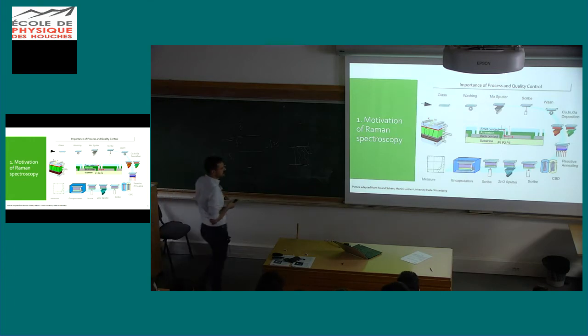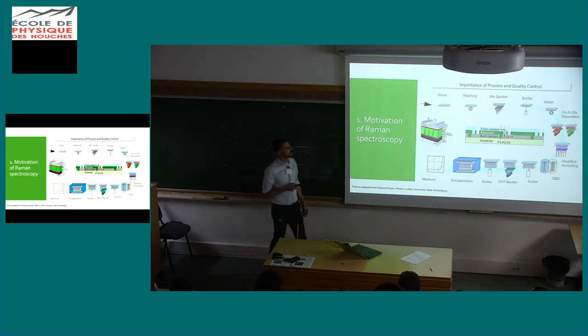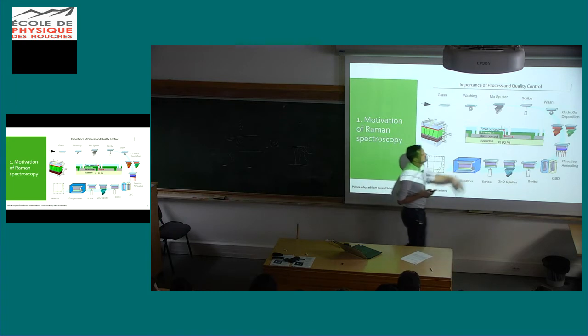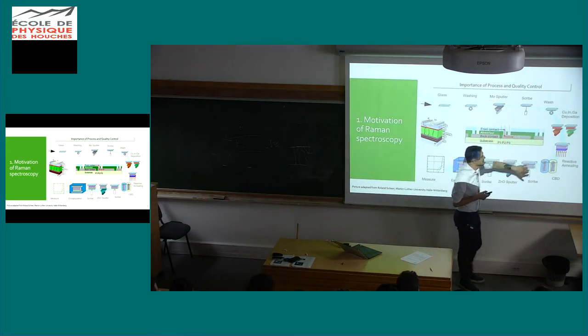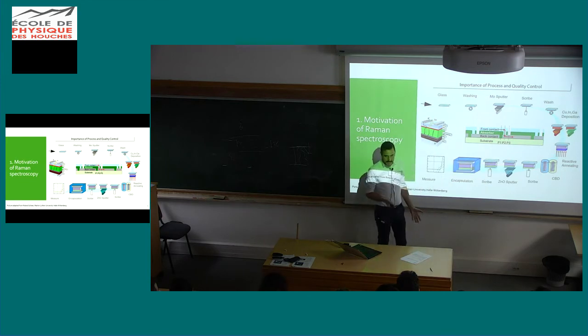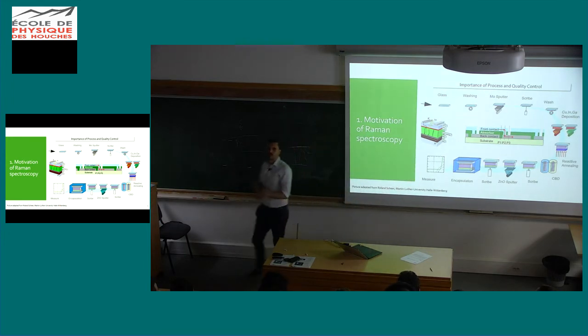And you measure it. If you are using just electrical measurement for characterizing your device, this means that you have to finish it. That is extremely expensive to know if your device is good or not. What Raman spectroscopy and other techniques allow is to start to characterize every single step in this process. And if some of these steps fail, you can stop the production of your module and save a lot of money. And this is one of the main advantages.